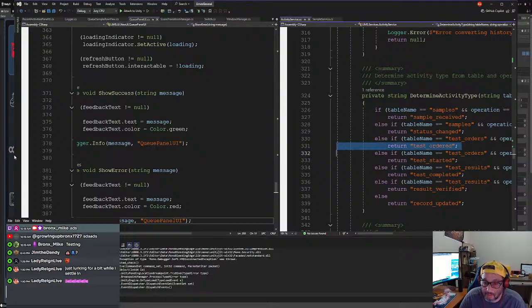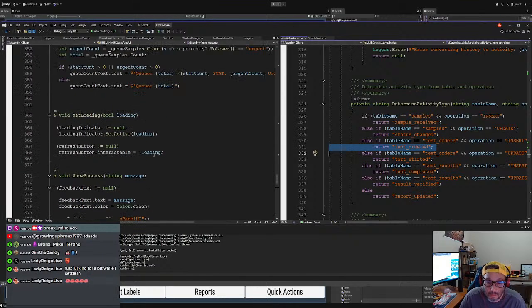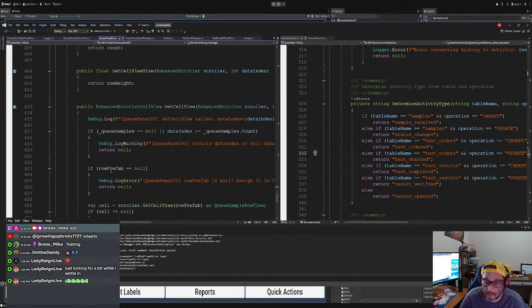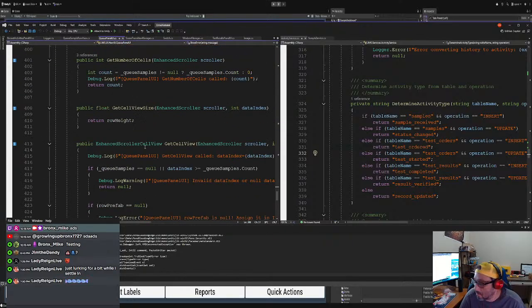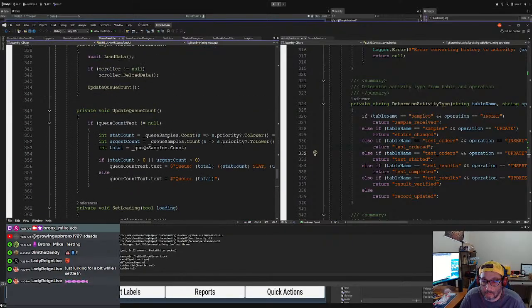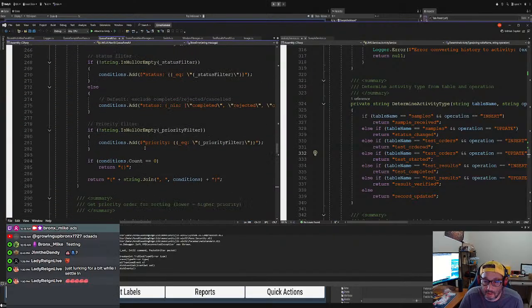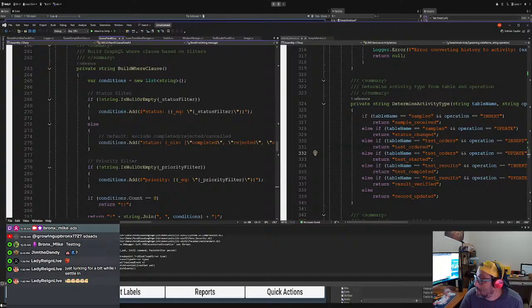Come on, come on. All right, so we here. So, where is it? Let me see. Where is it? Where's the problem? Q panel.